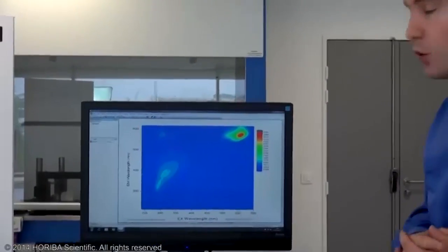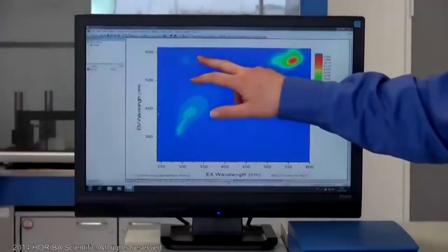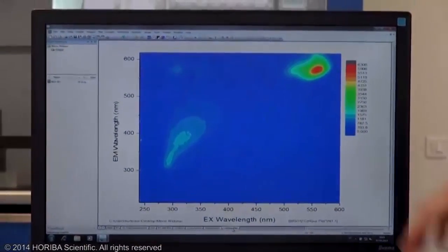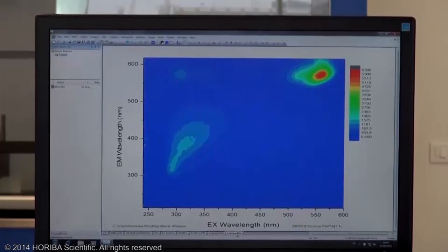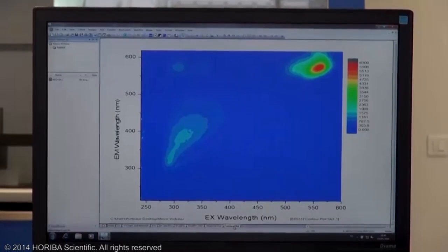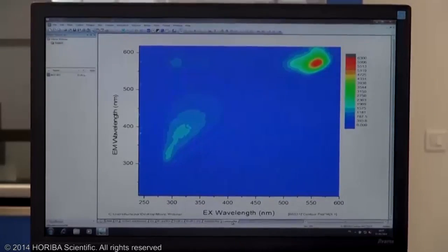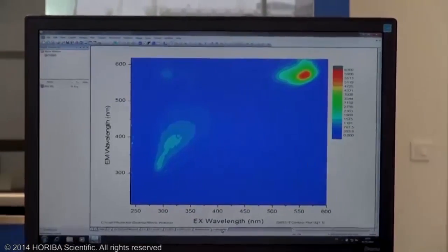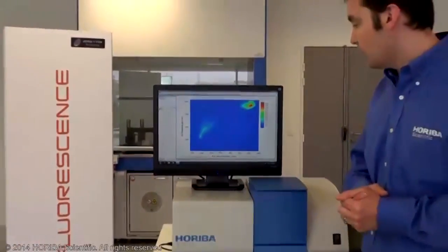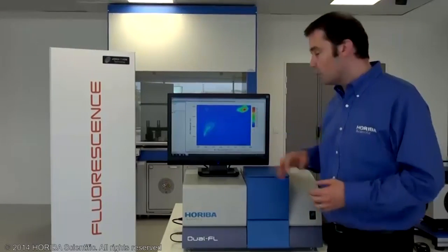So it's a specific sample, a solid sample right now, with rhodamine inside and some other compounds. So typically EEMs, and I guess most of you know about this. Again, an excitation emission matrix can give you a lot of information about the sample. If you know what is inside, you will find out exactly the concentration, for example, with the level of intensity. But if you don't know the sample, you can analyze it with a multivariate analysis, like PARAFAC or PCA, to know what is what, okay?